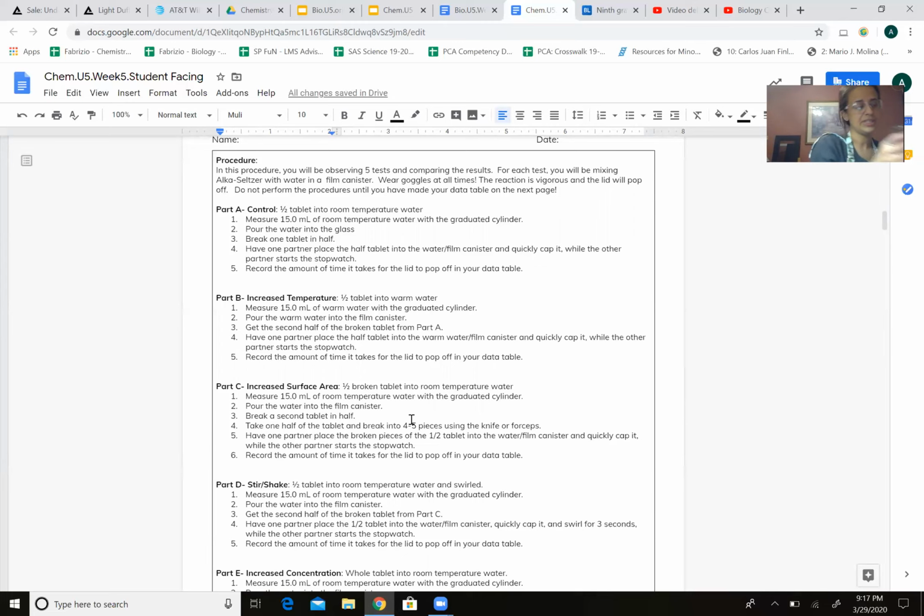So just feeling it, I know you guys can't feel it. This one's a lot warmer. It's actually making me quite warm in my room right now. Experiment C, we're going to increase the surface area, meaning we're going to break up the tablet more, so more parts of the tablet are coming into more direct contact with the water, and see how that affects the rate of reaction.